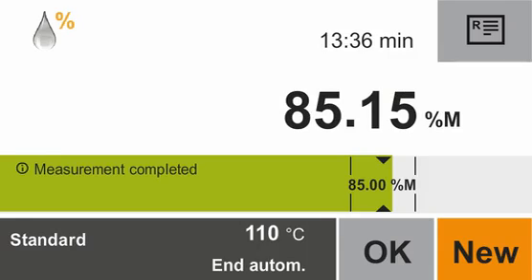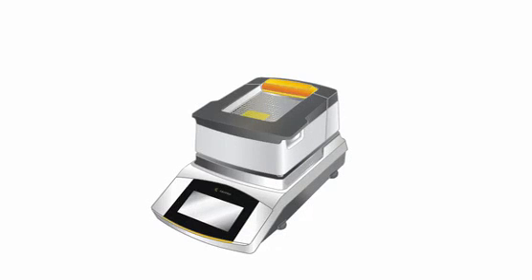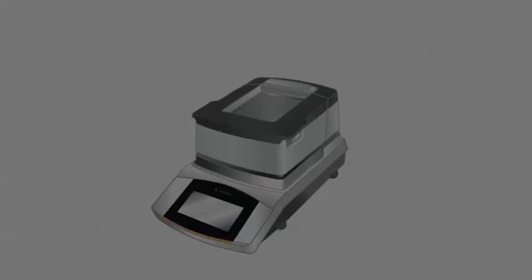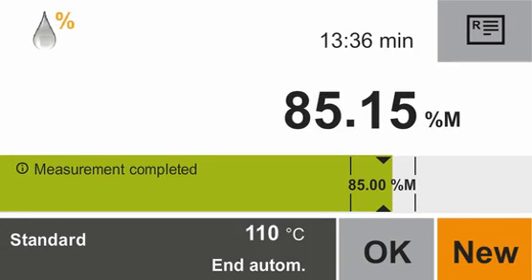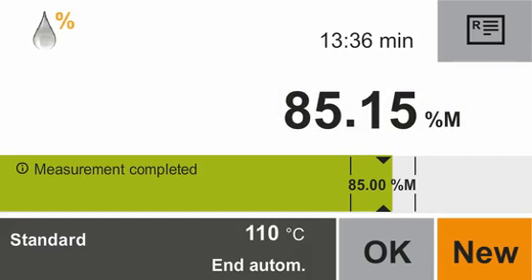When the moisture analysis is completed, you hear a signal. The light flashes three times and turns off afterwards. The results of the moisture analysis are displayed. This sample has a moisture content of 85.15%. You also have the option to get a printout of the protocol of the actual measurement via the report function.